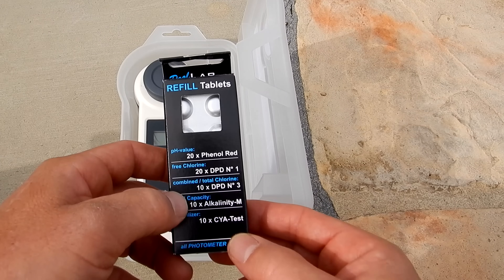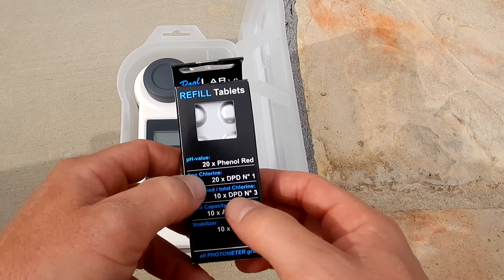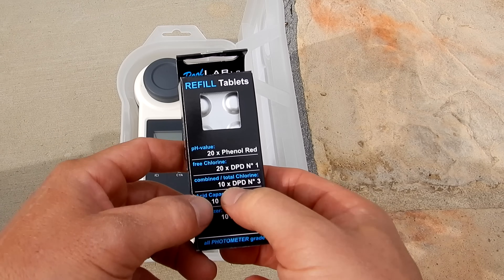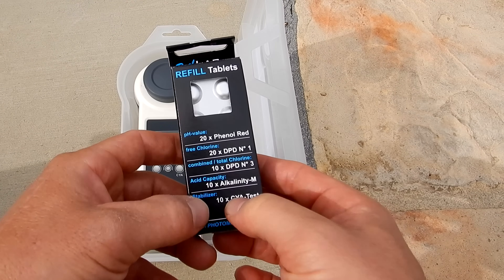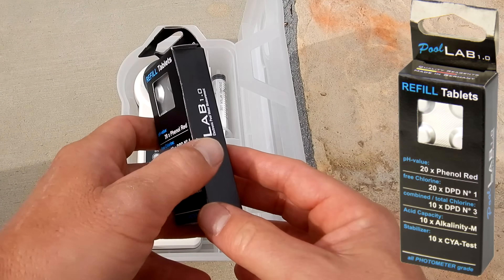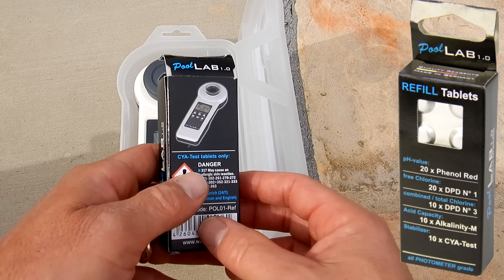Included with the PoolLab 1.0 are some tablets: you have 20 phenol red, 20 DPD-1, 10 DPD-3, 10 alkalinity, and 10 cyanuric acid tests. Of course, you can order refill tabs and also tablets for the other tests.